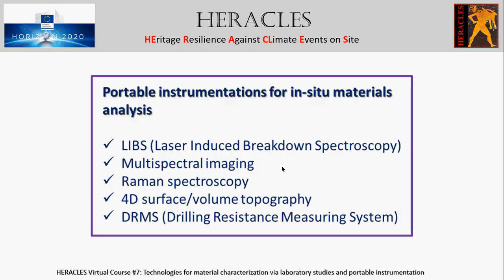The portable instrumentation for in situ materials analysis used at the HERACLES consortium consists of a group of techniques that we can take to the monument itself.